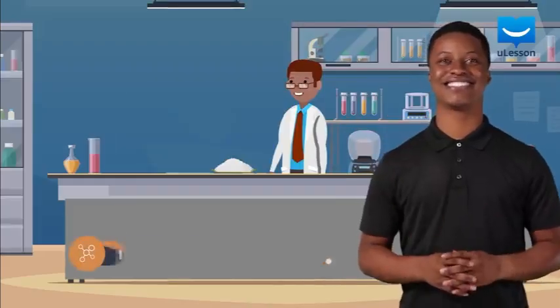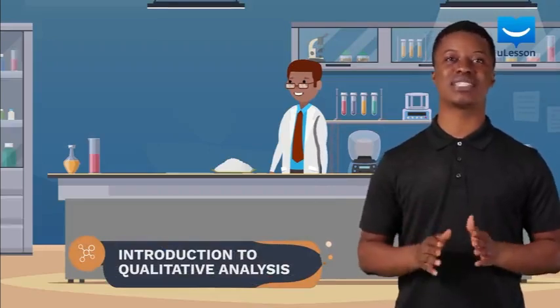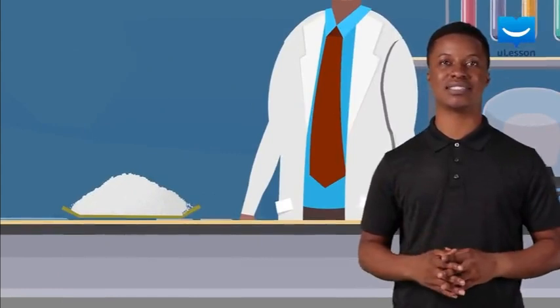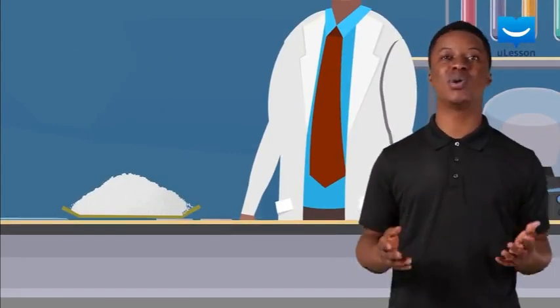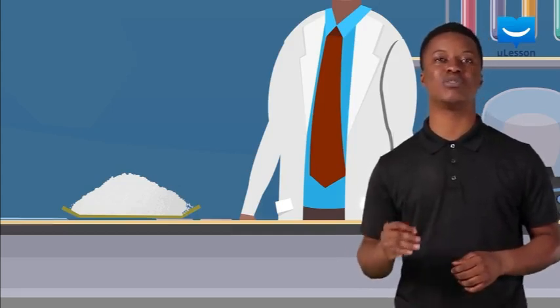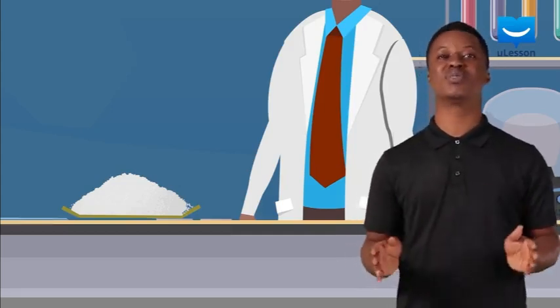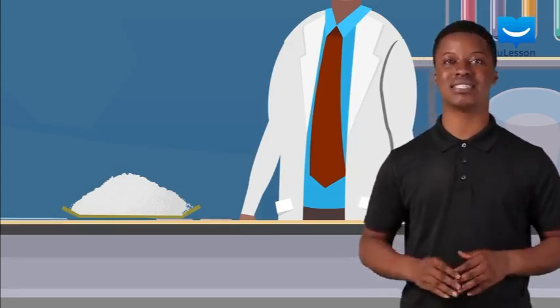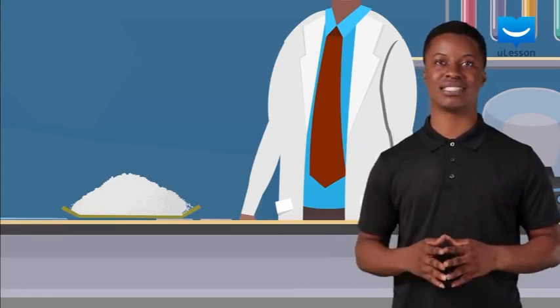So, hi guys. You may be faced with the task of identifying a sample of a white powdery substance. This may seem to be a daunting task because there are many solid substances that have a white powdery appearance. Not to worry, chemists have discovered methods of carrying out analysis to identify different substances.